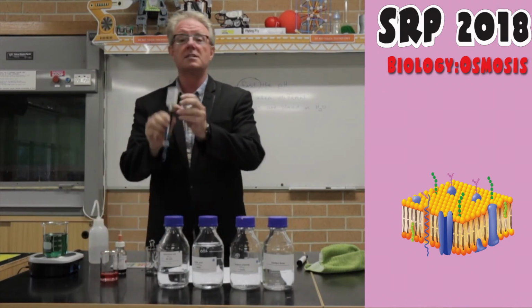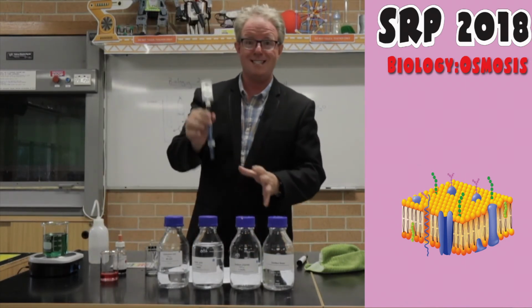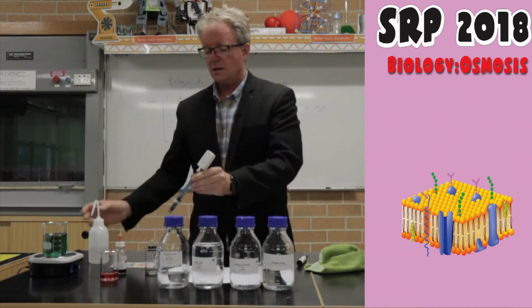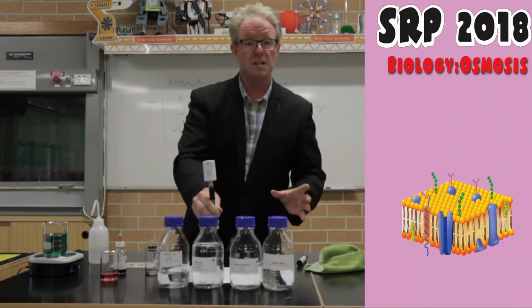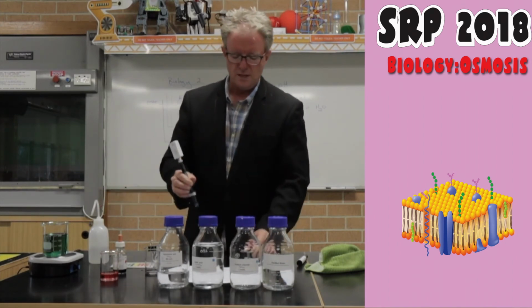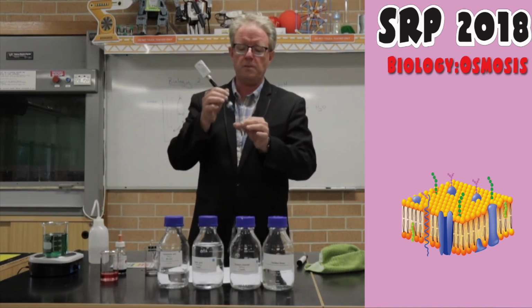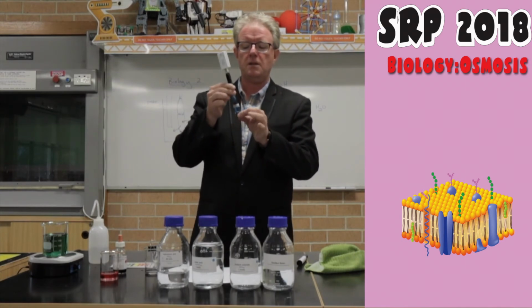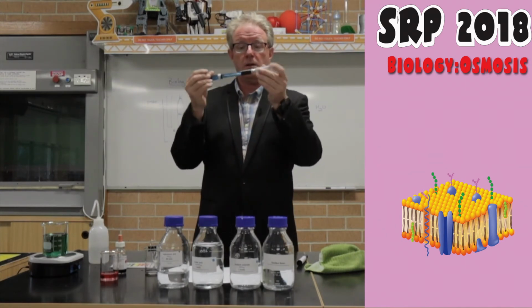And now that is nice and clean, and then you can test the next solution. So if I put it in the acid, I put it in there, get a value, give it another rinse, put it into the next one, give another rinse, etc. And of course, you always rinse it before you put it back into here. So I've already rinsed this probe. So you pop it back in there, screw it on, nice and careful, and we're all done.